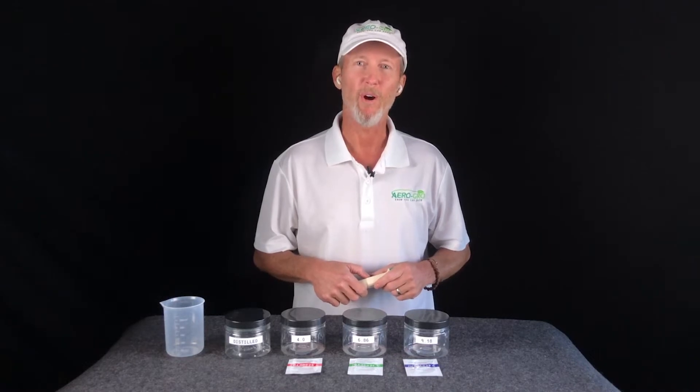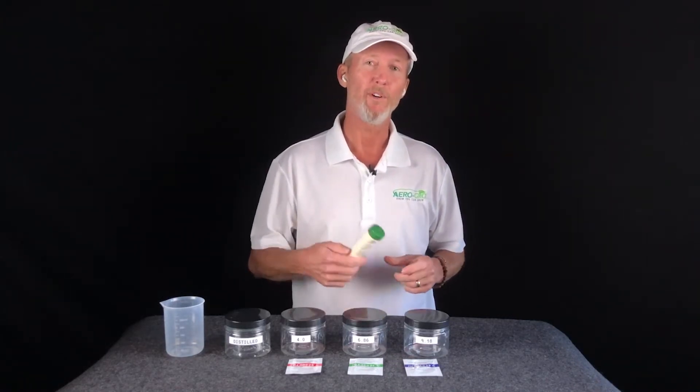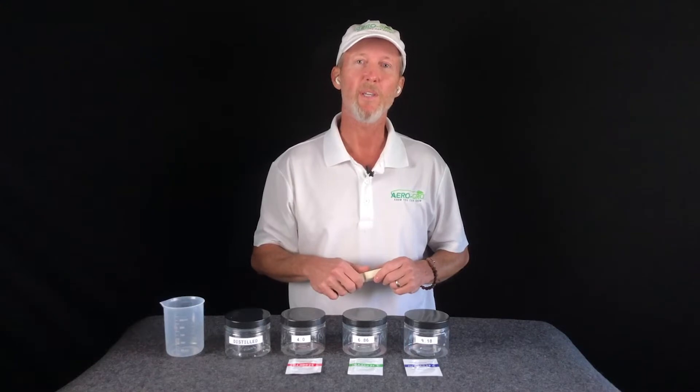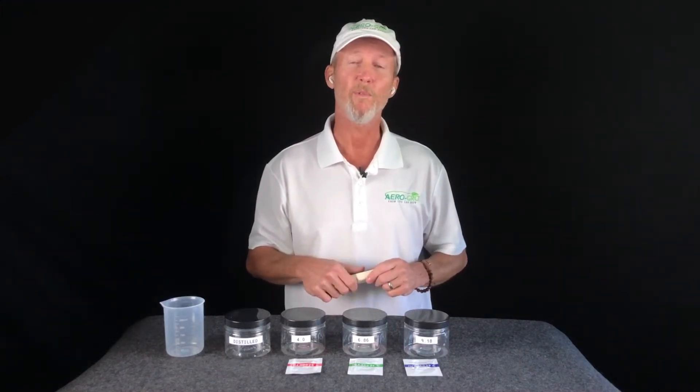Hi, I'm Andrew, the owner of AeroGrow. I'd like to thank you, first of all, for purchasing the 5-in-1 meter from AeroGrow. It's a great meter — we use it every day here at the labs — and there are a few things I'd like to show you to keep your meter highly accurate and dependable regardless of what you're using it for.